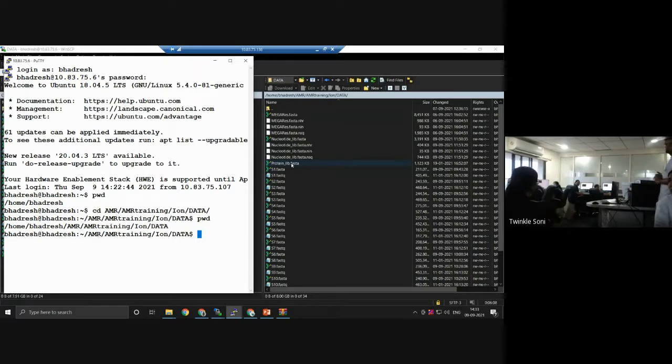If you do not create any database of these files, only one CPU can be allotted to a file, so it will take a lot of time. Moreover, if you are working on Ion Torrent data, the data will be quite high in size, so it will take more time. So for that, we need to create a database so that we can give threads to it.